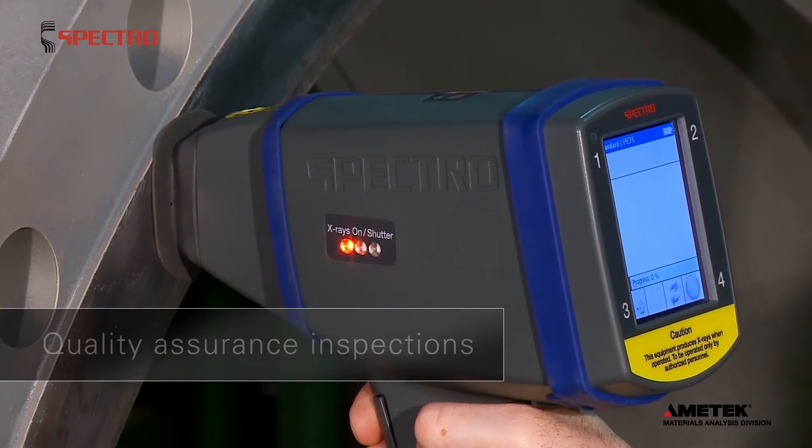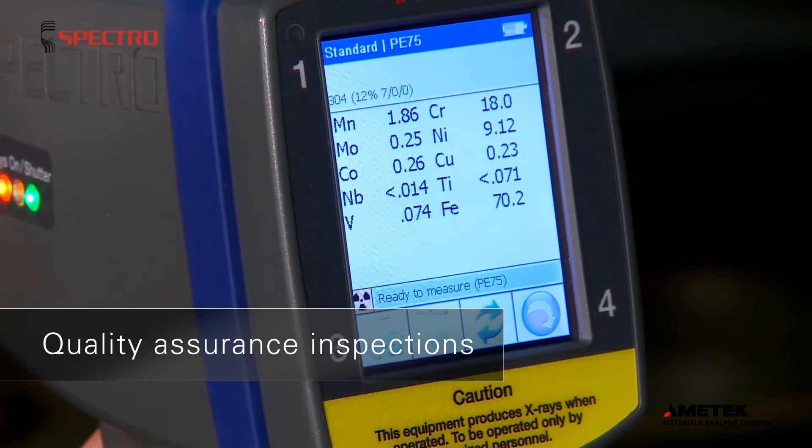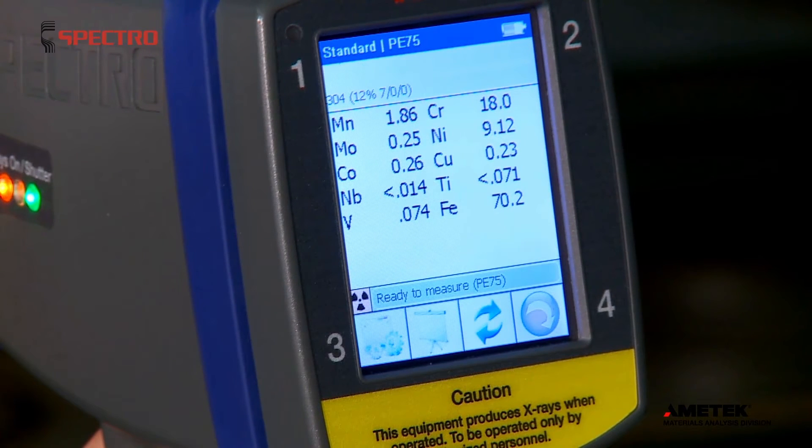Exsort is perfect for PMI in all sorts of facilities. For example, in the repair shop, it delivers quick QA inspections with lab quality results.